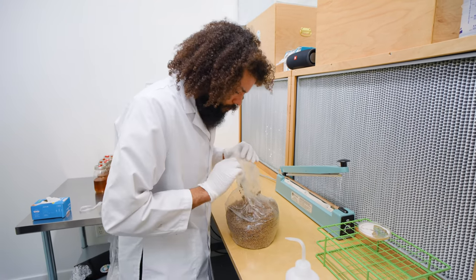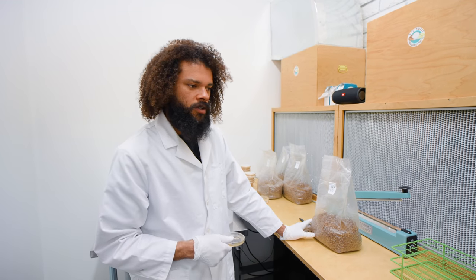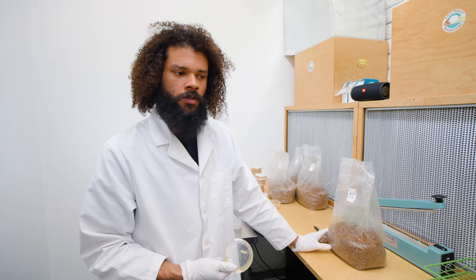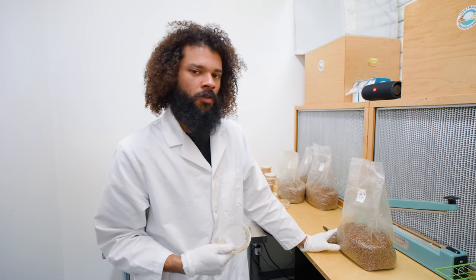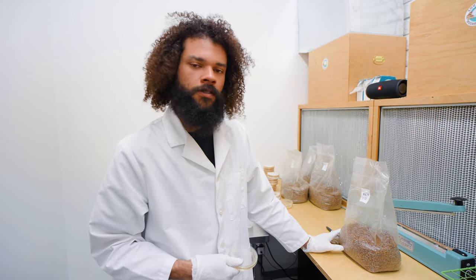We have the spawn inoculated, and we have six bags here. This will turn into 60 more bags of grain spawn in about two weeks. From there, we can move it to the next part of the life cycle — the next stage of the process.